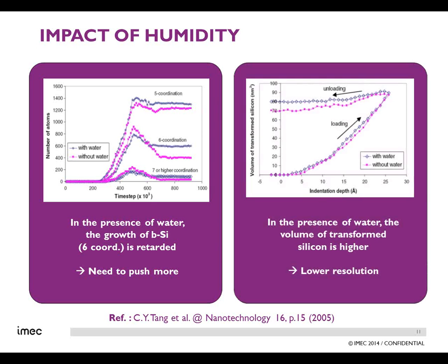And the second conclusion was that when water is present and you make an indentation and release up to the same force, you notice that at the end you have a plastically deformed pocket that is larger. It means that for the same force we apply, when we reach the force that is enough to generate plastic deformation, we deform a broader area. We are not able to indent so locally, to generate pressure so locally, and we are not able to generate a plastic deformation as small as we can in vacuum.